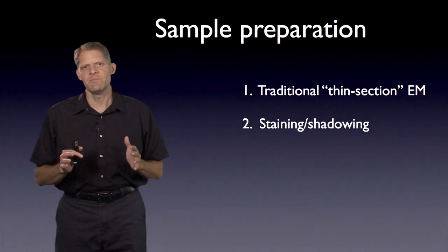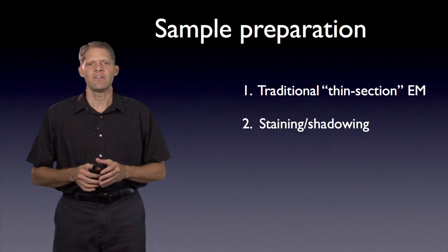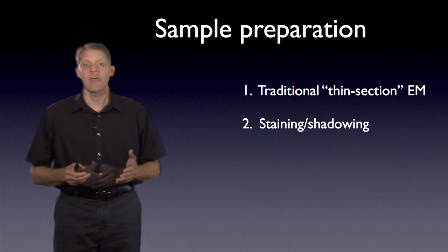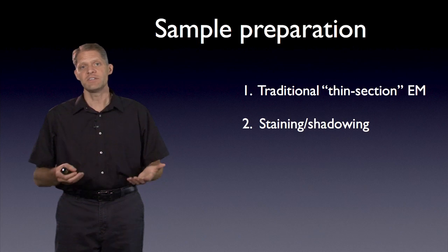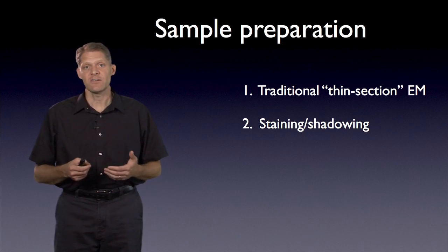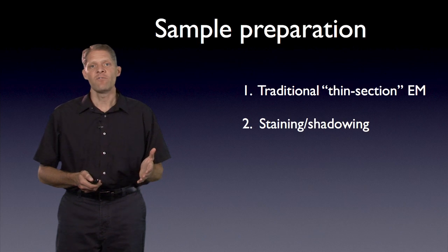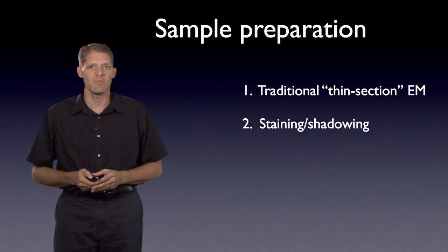Now, a fundamental limitation of traditional thin section EM and staining and shadowing techniques is that they involve dehydrating the sample. And of course, living cells are hydrated, so there's no guarantee that the molecules inside will maintain their structure through the dehydration process.